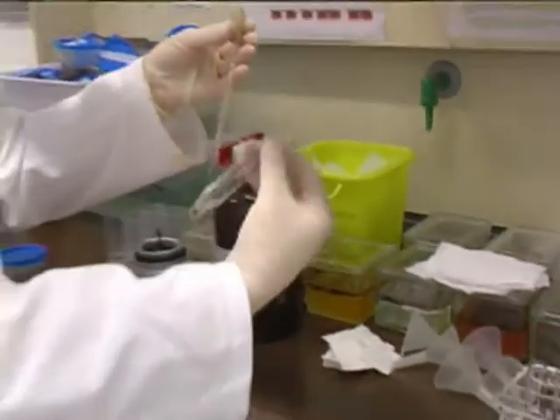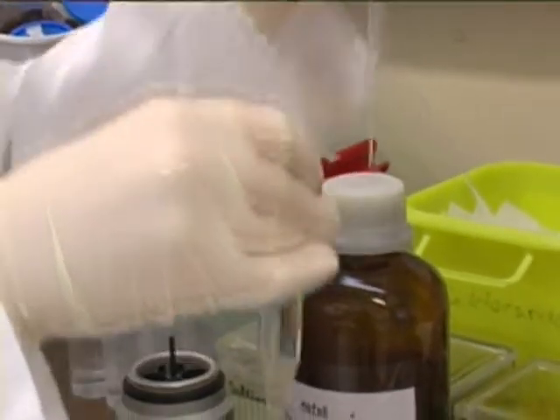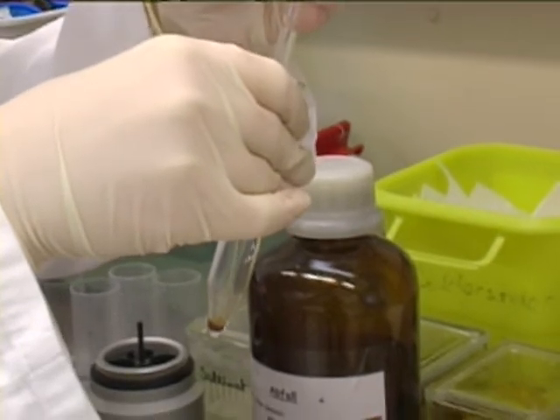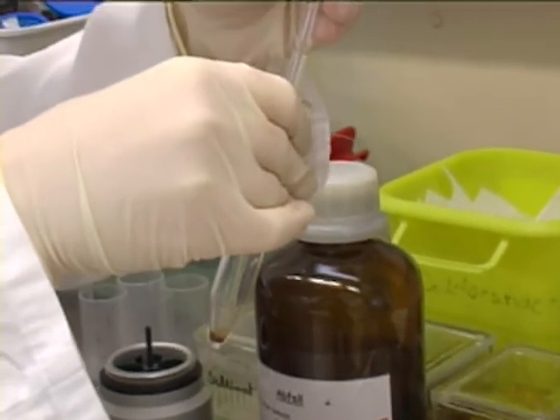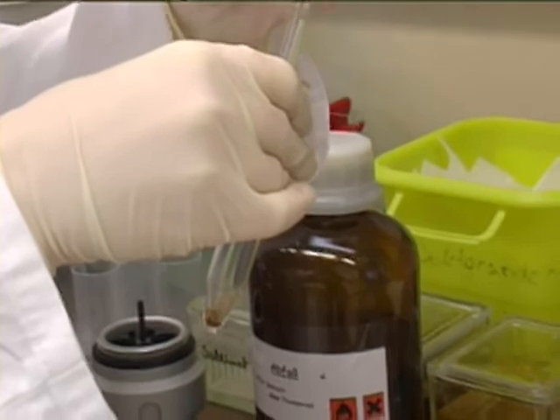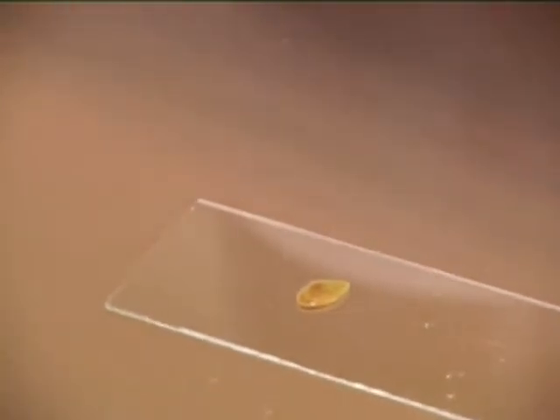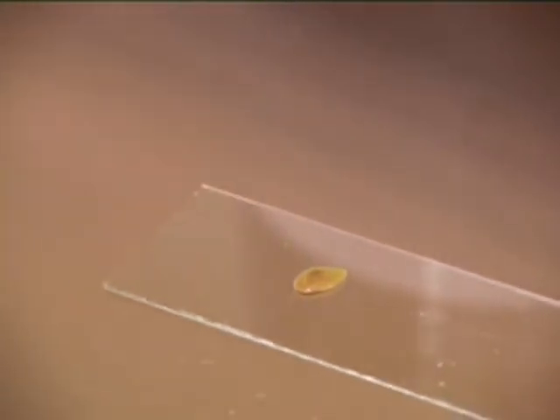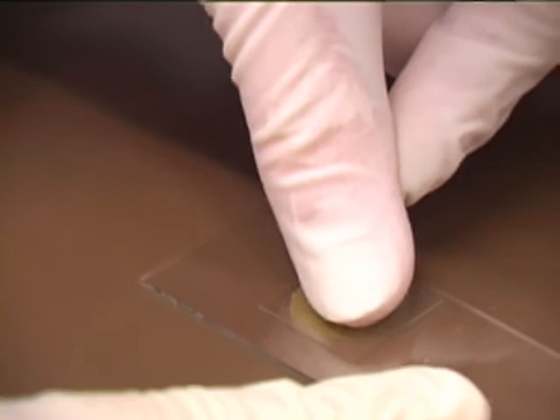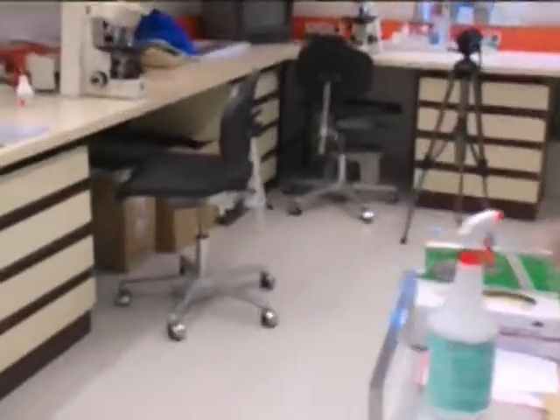You need a little bit of solution on top of the sediment. So you can mix it a little bit, oder auch nicht. Das ist schon sehr dick heute. Es muss sehr dünn sein. It has to be very thin. And now press it under the little glass tile. Now you go to the microscope. Yeah, and we're ready.